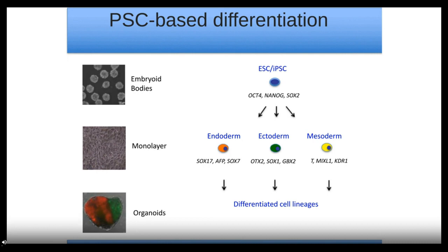The way we started to culture and differentiate these cells was by generating cellular aggregates that we termed embryoid bodies, that you can see here. These embryoid bodies were then differentiated using protocols based on spontaneous differentiation, and this spontaneous approach was not a very efficient approach, as typically you're only able to develop about 1 to 3% of the cells that you're interested in in this system. However, this way of differentiation was still the gold standard as late as 2000, I would say 2010.